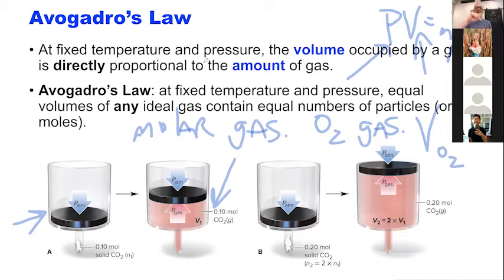What's that pressure going to be equal to? The pressure of the gas inside that cylinder, inside our graduated cylinder, is going to be the same as the pressure of what else? On the outside of it? There you go. Exactly. It's going to be the pressure inside the room. And so we can pretty much assume that the atmospheric pressure is going to be around 1 atmosphere, because that's generally the pressure. It's going to be pretty darn close.